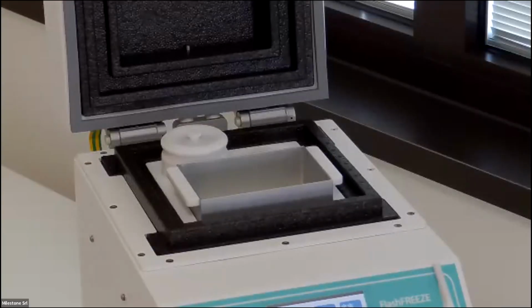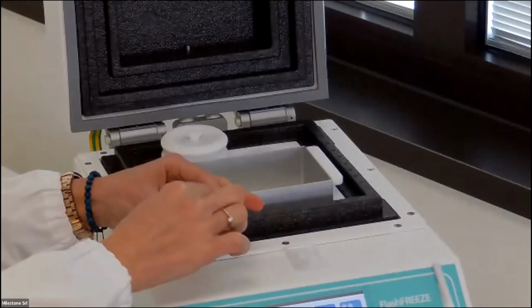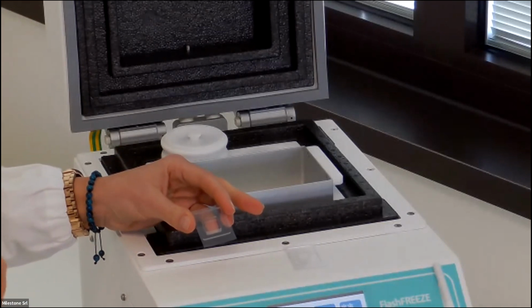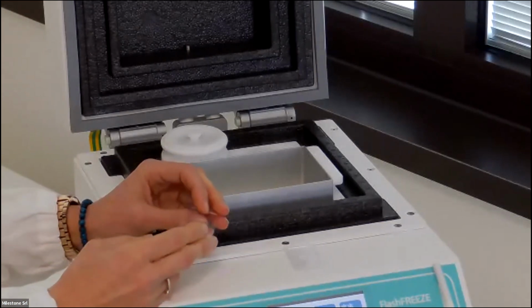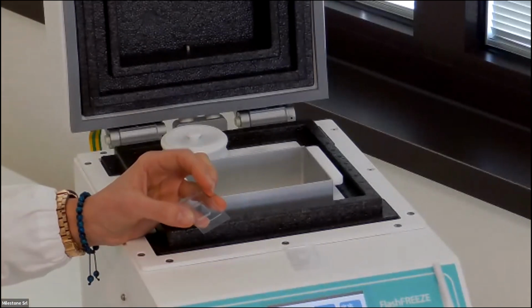Thank you, Miriam. Speaking of cryomolds, we have another related question. Are the cryomolds disposable or reusable? No, normally they are disposable. Because the normal use of the cryomold is to insert the sample, then the cryoembedding compound, so that at the end of the freezing you have a block and you can use it in the cryostat. But when you pop out the block, you basically damage the cryomold, and normally they are not reused. It's better to change it also to avoid cross-contamination between samples.